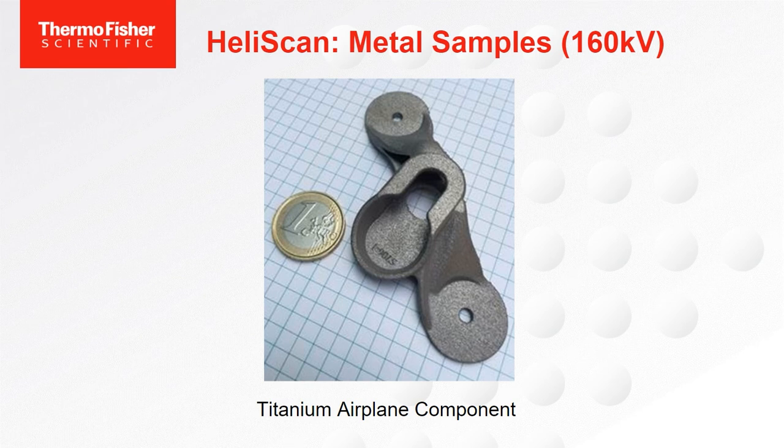I'm only going to scratch here for a second as a reminder that Robert mentioned in his talk a wonderful instrument that can go up to 9,000 kV, and that's fantastic with 2 meter by 2 meter samples, and that's excellent. But of course, that lacks the highest resolution. So with 160 kV, there are still 1,000,001 samples and examples that you want to be able to take advantage of this kind of technology.